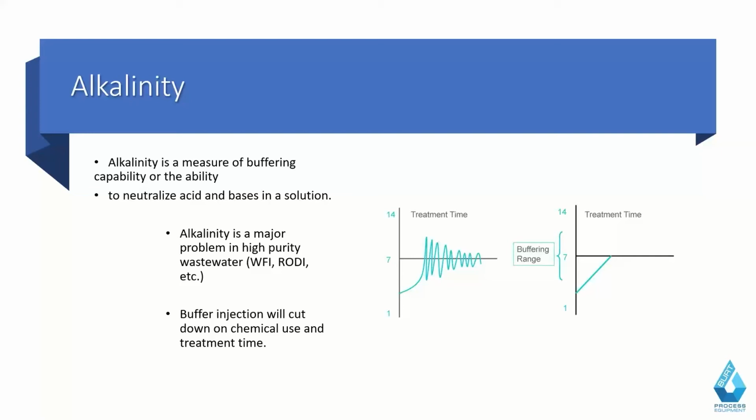Otherwise, what ends up happening is, as you do the treatment, you end up with this kind of oscillatory pH curve here. That's because your reagent.